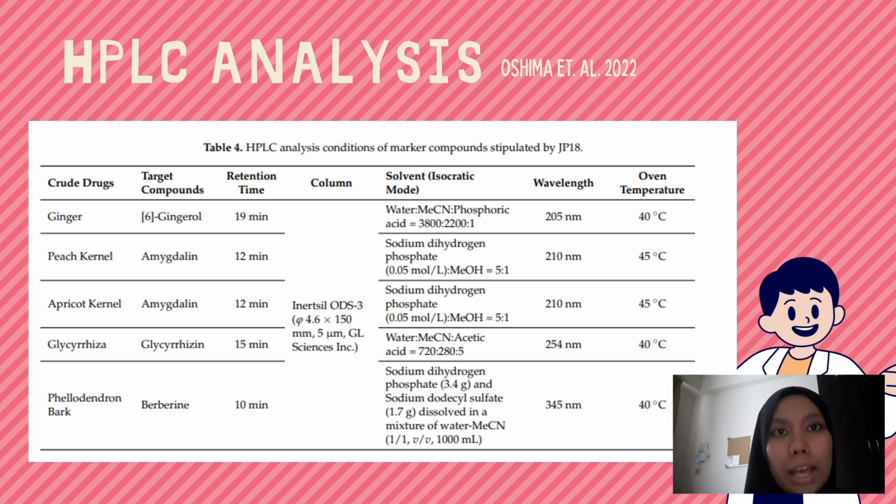In the previous slide, the crude drug was analyzed by TLC, thin layer chromatography. So in this slide, it will be analyzed by HPLC, high performance liquid chromatography.